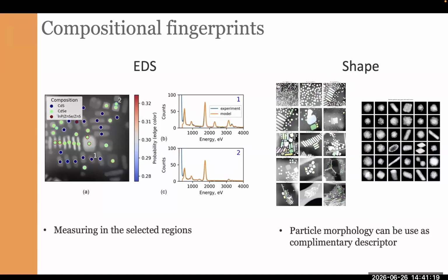The last point I would like to pay attention to is the compositional encoding. We need to define the composition, and in the case of EDS, it can be time consuming, and sometimes we need to balance. I already mentioned that to some extent we can combine our EDS with clustering, and we can use some approach for real-time optimization of the time we spend on composition estimation and the expected error of this estimation.